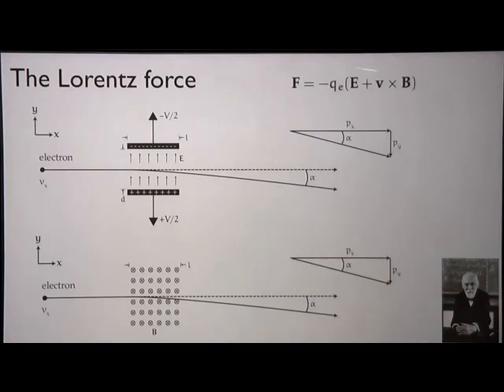Okay. So we have a beam of electrons. How are we gonna make a lens? So before I tell you how we make a lens, I have to tell you how we move an electron. So for the students in the room, this would be the only equation I would really pay attention to. Right? There'll be plenty more equations, but this is the one you want to remember. So this is the force on an electron, or any charged particle, actually. It's called the Lorentz force. And it's a product of both the electric field and the magnetic field times the velocity of the electron.